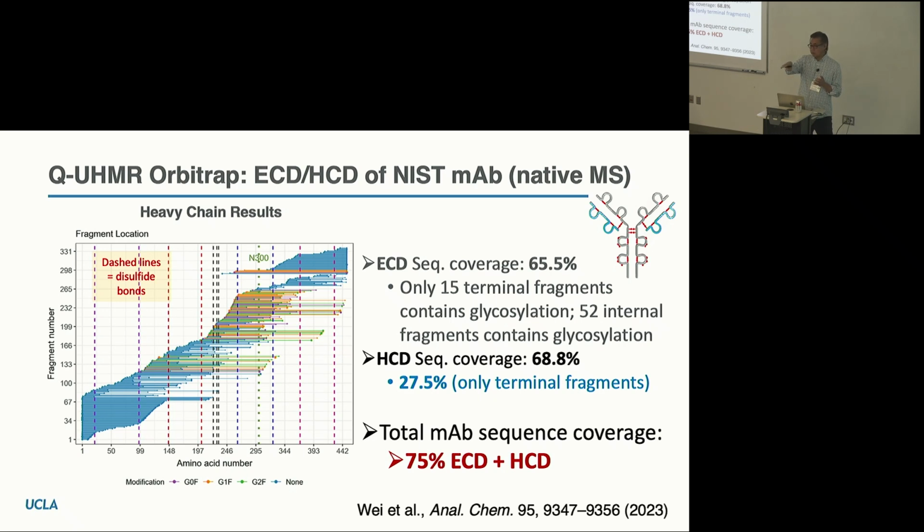Well, that's for UV, right? And so later, if you follow the progression of MALDI, there was a group of people saying that IR lasers would be better. There was a group of people trying to promote the use of ice as a matrix for IR MALDI to look at large protein complexes. And then there was this phenomenon called single shot MALDI, where you fire it once and you magically get a spectrum of a native assembly.